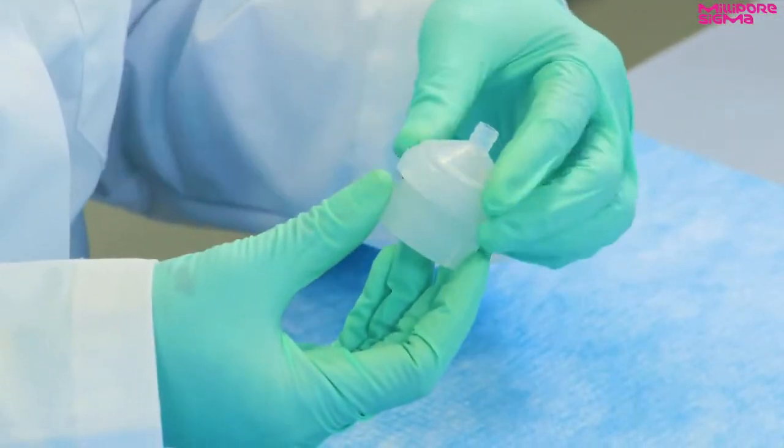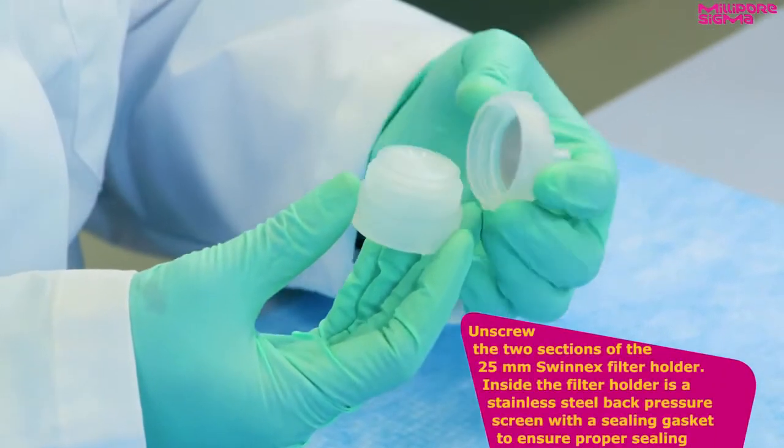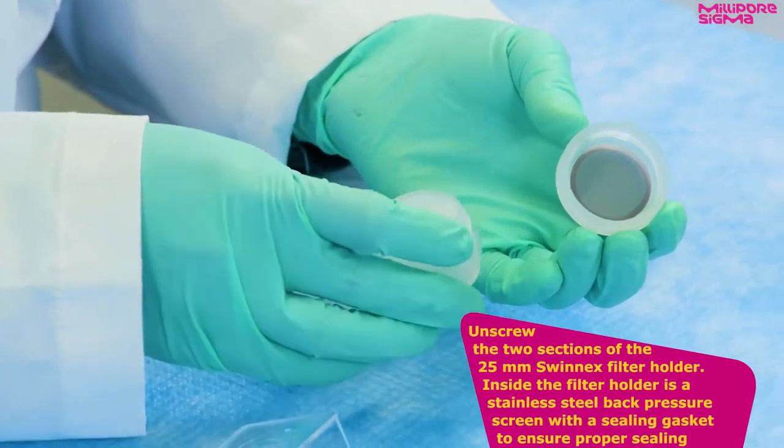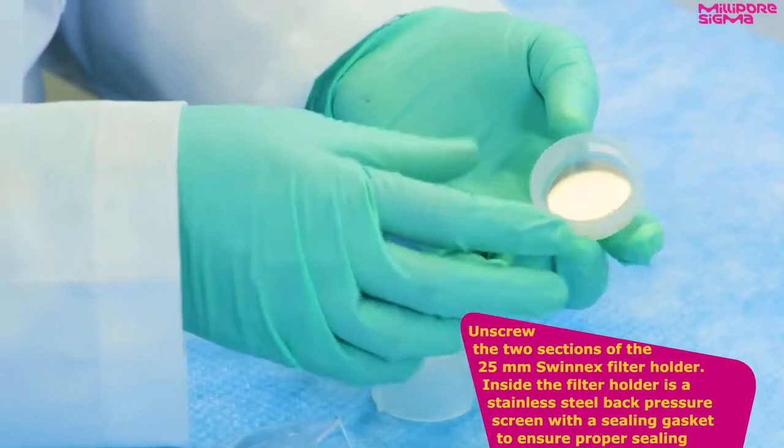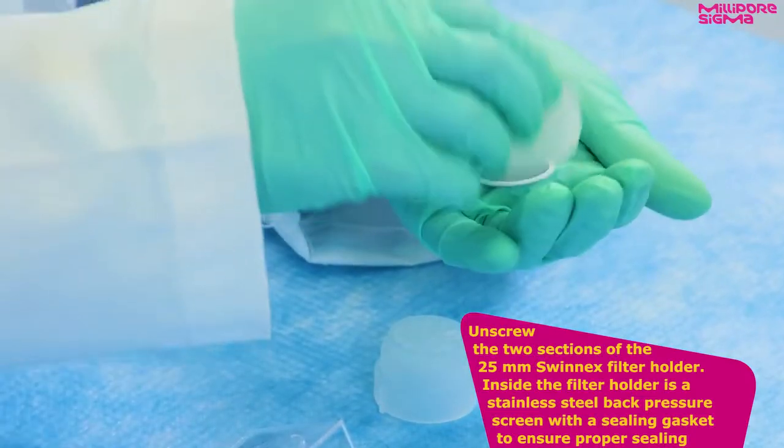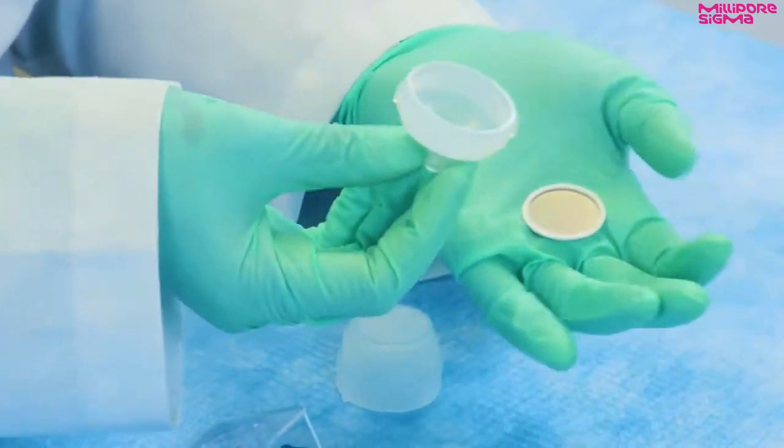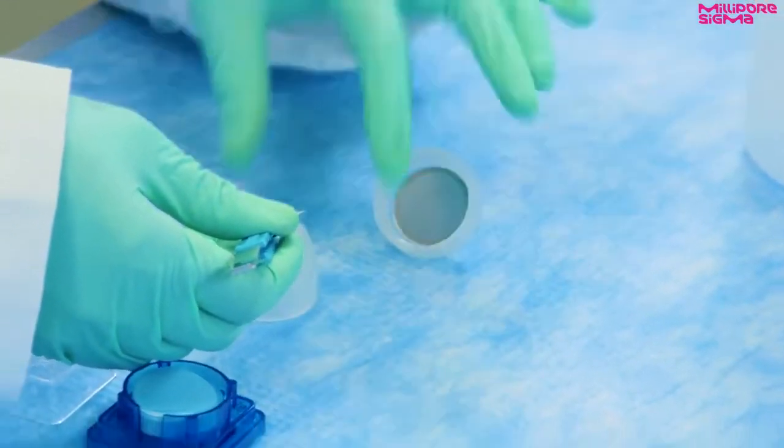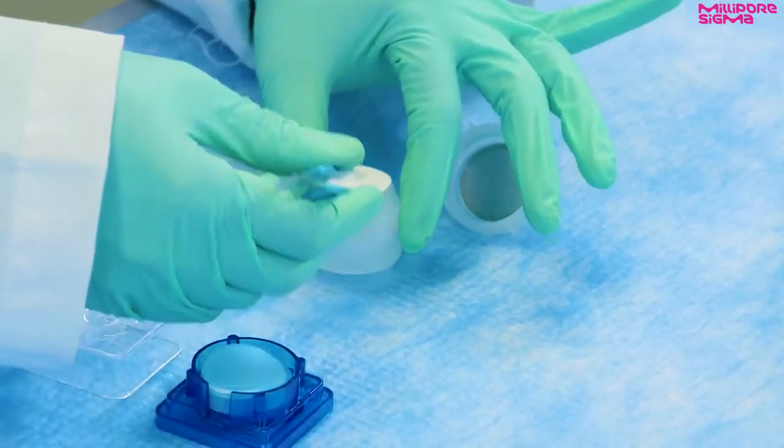To prepare the filter for rinse solvent, first unscrew the two sections of the 25 millimeter Swinnex filter holder. Inside the filter holder is a stainless steel back pressure screen with a sealing gasket to ensure proper sealing. Use forceps to center a 25 millimeter white filter disc on the perforated plastic support in the lower section of the filter holder.